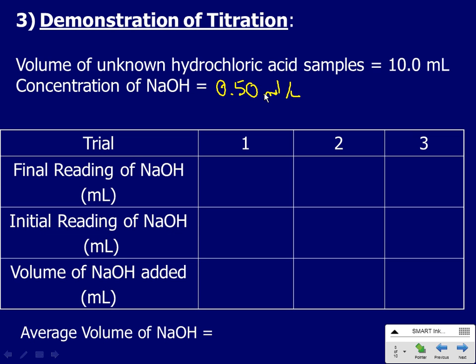Oh, and that's really close to the graduation mark. All right. Okay. Drop the side. In. There you go.